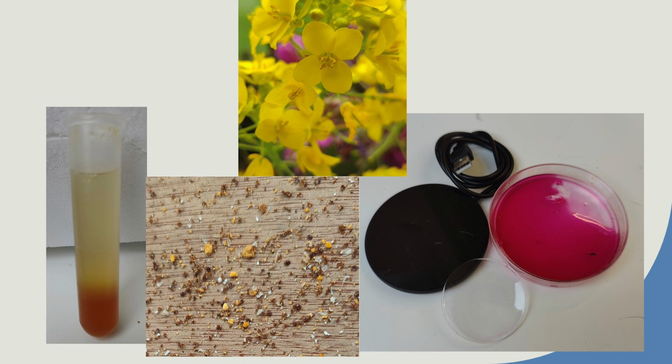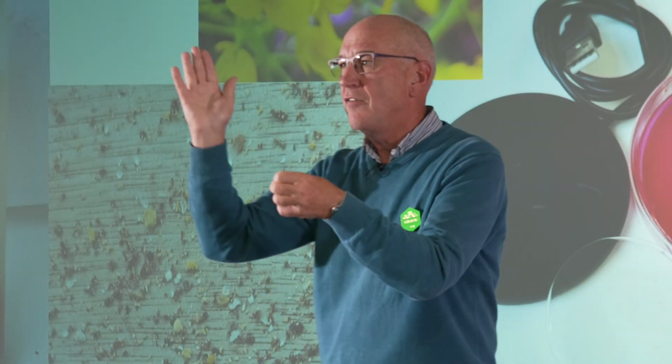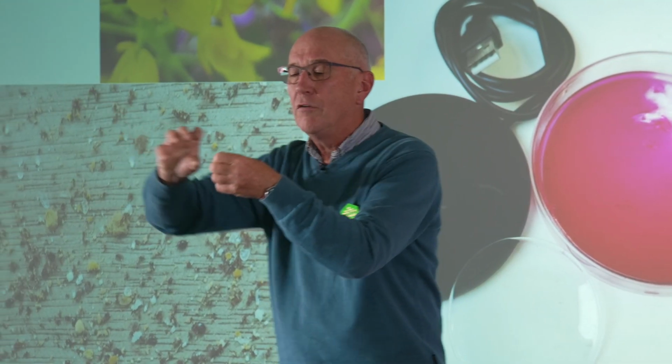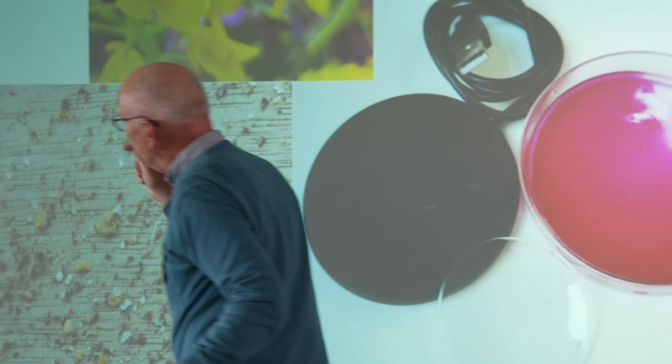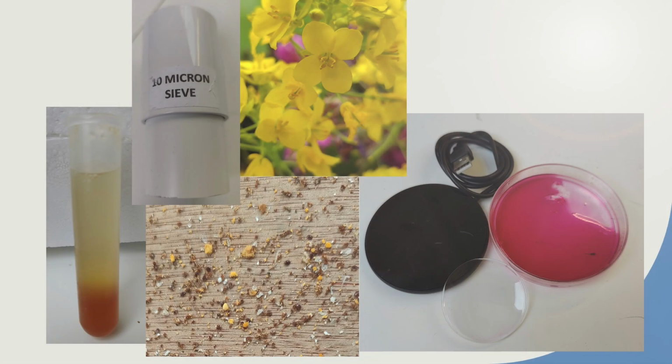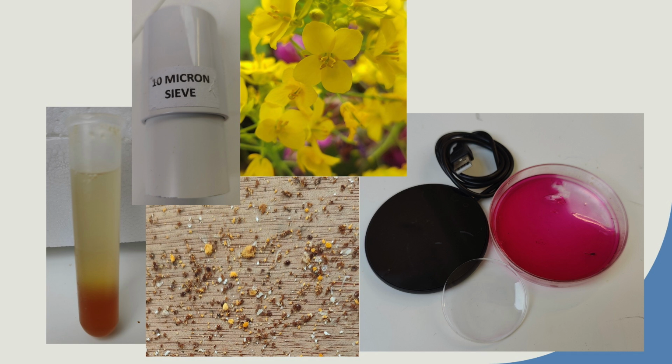because what you don't want to do is do a slide of sugar. A slide of sugar messes everything up. So what you want is the honey to go into the water to drain it off, and then you just stick your glass rod in the bottom, dab it onto your slide, Bob's your uncle, you've got a slide of that honey.